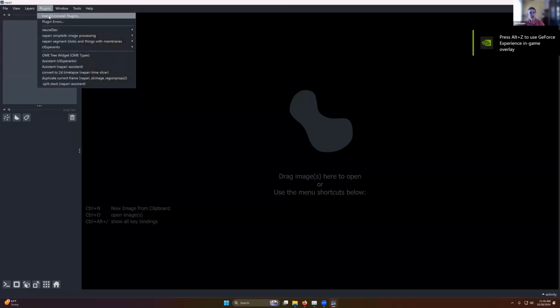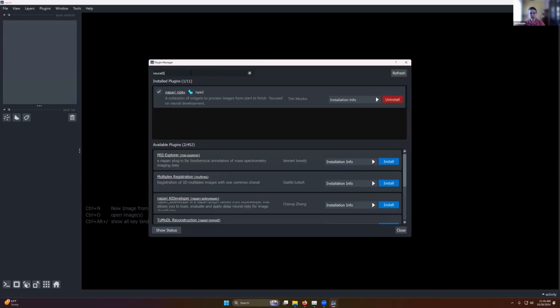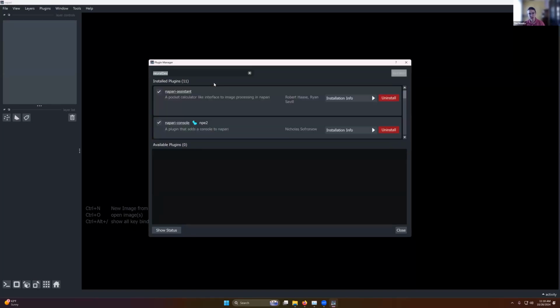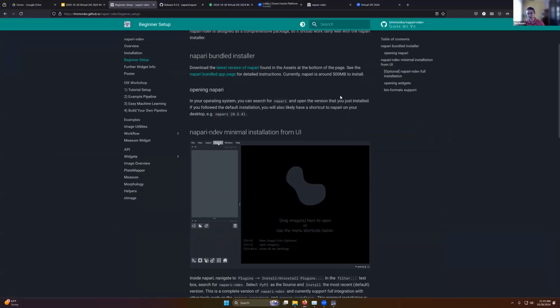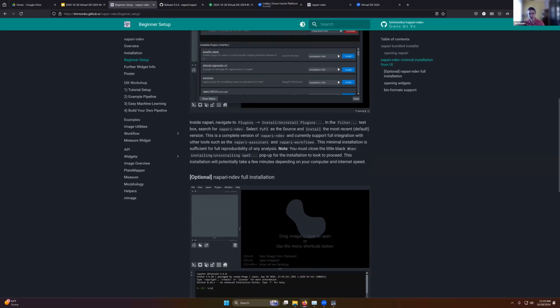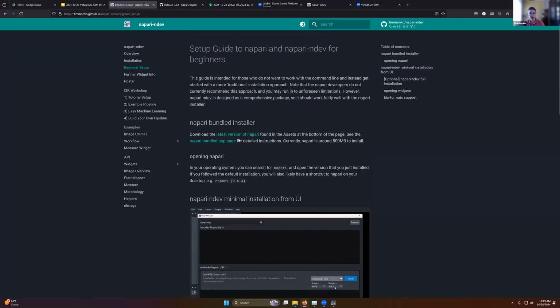We can go to install, uninstall plugins. Then you can search for, for example, napari-ndev. It will normally show up down here, even if you have to refresh it. Okay, so right now it's going with the name napari-ndev. Sometimes it picks a different one. And you'll normally want to pick the PyPI source in any version, just pick the most recent version. So I will be working with the same setup that you have, and you can see how to do that in these GIFs. I hope that you find them helpful. So just have that downloading in the background.